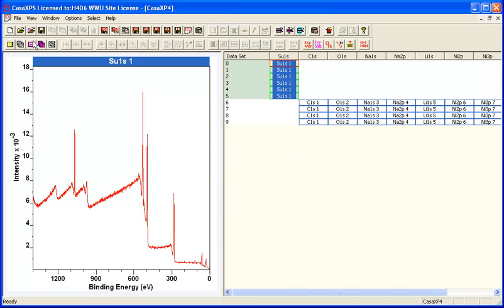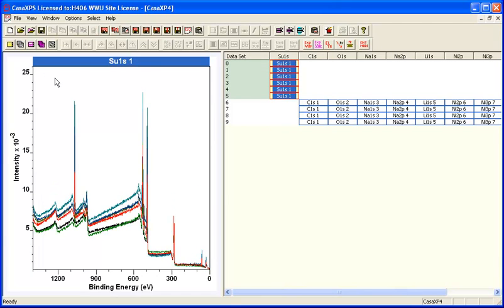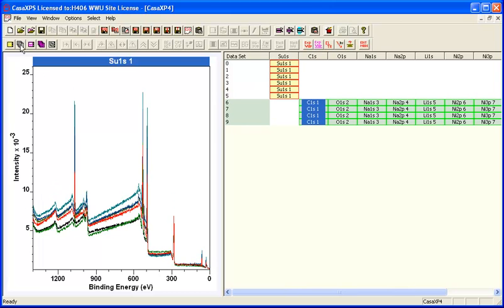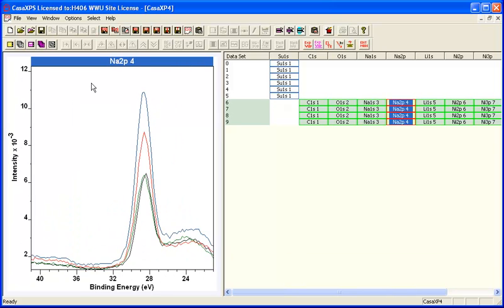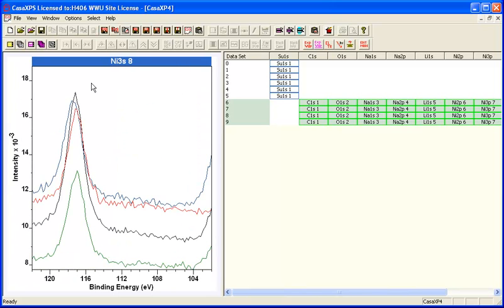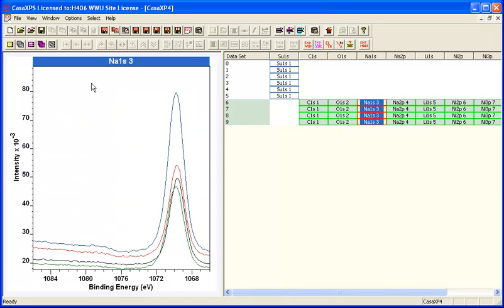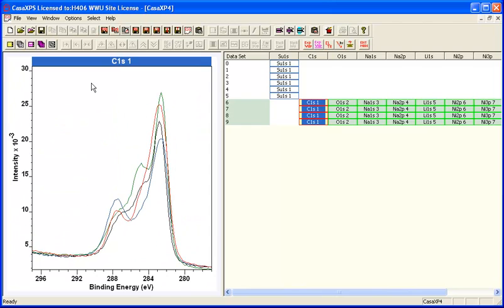You can see that the files included a set of survey spectra and various files that contained high-resolution spectra, all measured from samples that have been specified as data set 0, 1, 2, and so on.